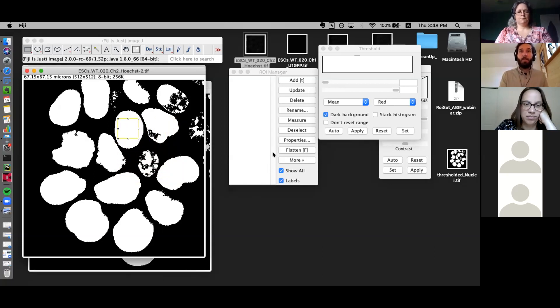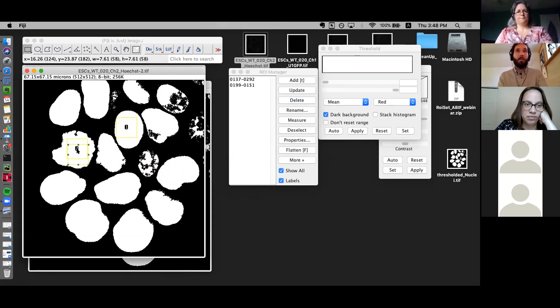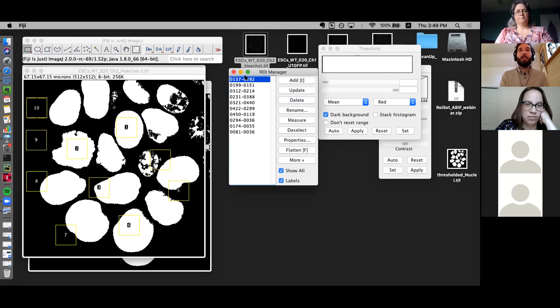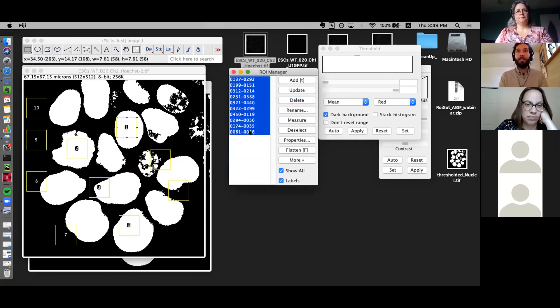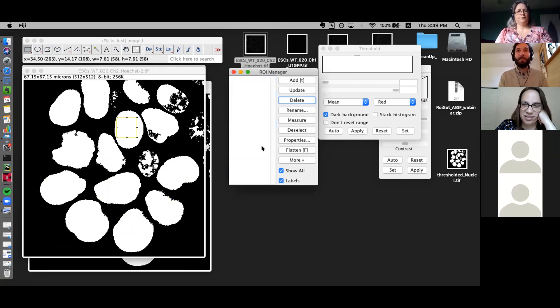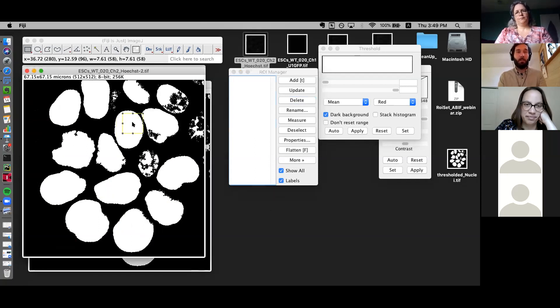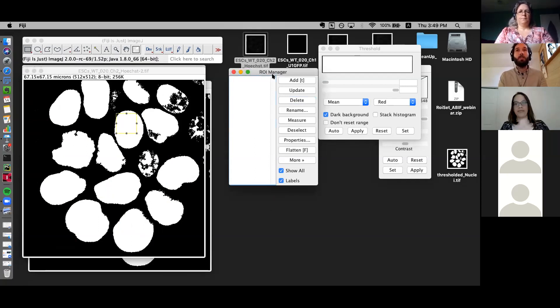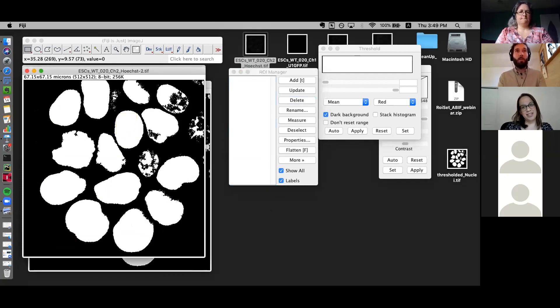There's a question about selecting all ROIs. If you have multiple ROIs, you can click the first one, hold down Shift, click the last one, and delete them quite simply. You can also use Command+A — or Control+A — but make sure you do that in the ROI Manager, because Control+A will also select the whole image, and if you delete that, you'll lose your information.